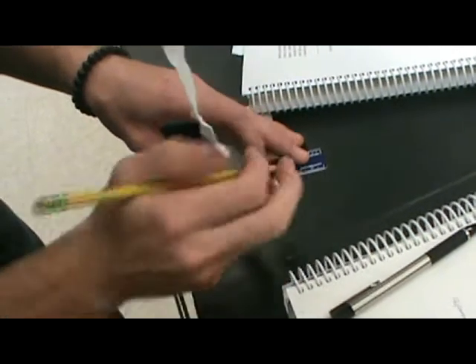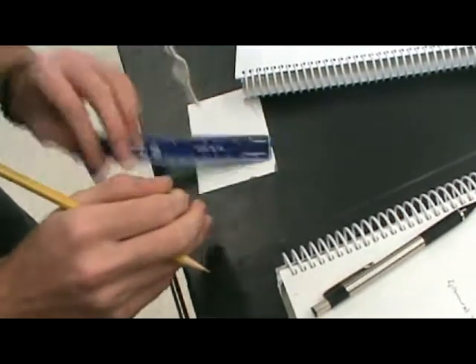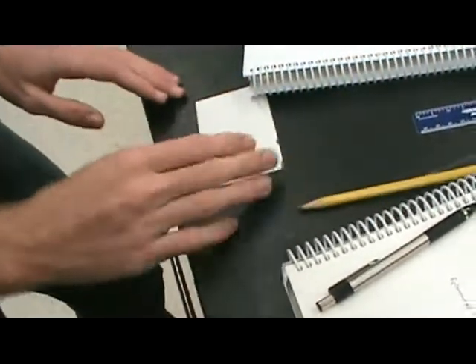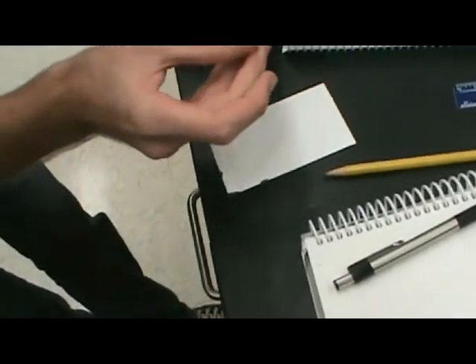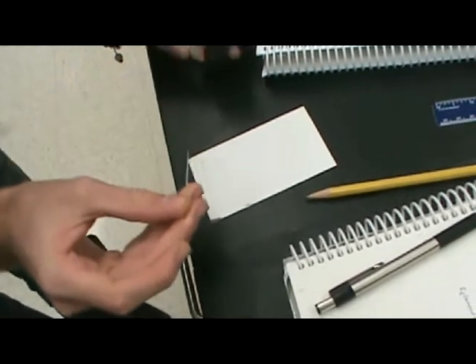One phase being stationary while the other phase is mobile. Alright, well that's pretty much awful, but I did it anyways. It's beautiful. Exactly 1 centimeter from the bottom. So now I just do a dot of everything. They just gotta lay that huge load of methyl on there.